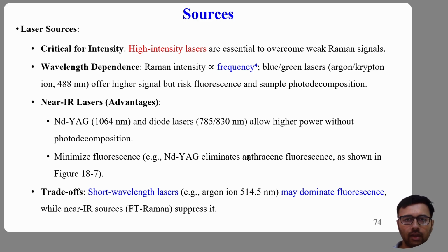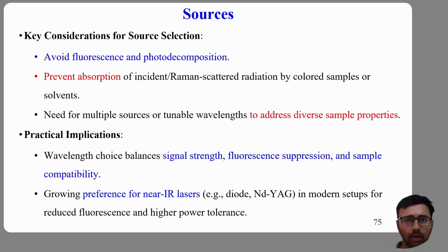High energy lasers also introduce another danger: photodecomposition. The laser can literally burn, degrade, or chemically alter the sample. Biological materials are particularly sensitive. Even moderate laser powers can damage protein tissues or polymers.